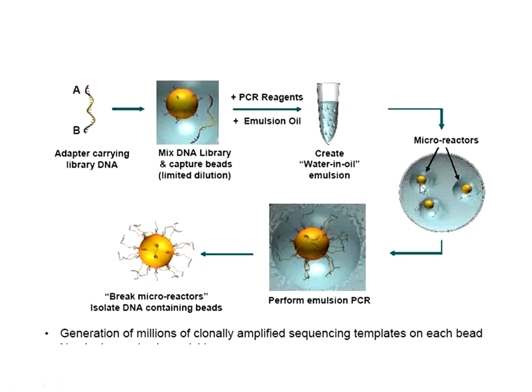Here the DNA fragment attached to this micro-sized bead will be amplified into a number of copies and will remain attached to the bead. So emulsion PCR carries out the formation of multiple copies of the DNA fragment attached to the micro-sized bead. After that, the emulsion is broken down and the DNA-containing beads are isolated.